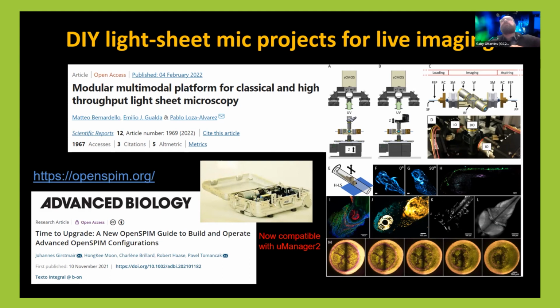Now, Emilio Gualda continued working on this and tried to obviate the problems of being stuck with older versions of Micromanager for running the setup. We started doing development in LabVIEW as well. And I would invite you to follow up his work. He's just published a few months ago this beautiful rendering of several flavors of light sheet microscopy, of a do-it-yourself setup. As I said, the biggest limitation now is figuring out the resources to go back and rewrite code and readapt everything to Micromanager 2, which we have not been able to maintain, but the OpenSPIM project has been, and I invite you to follow this.